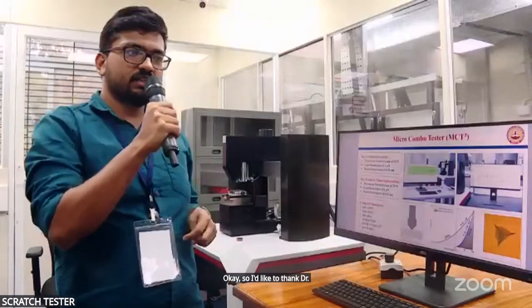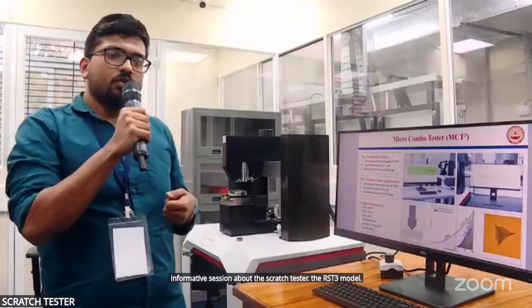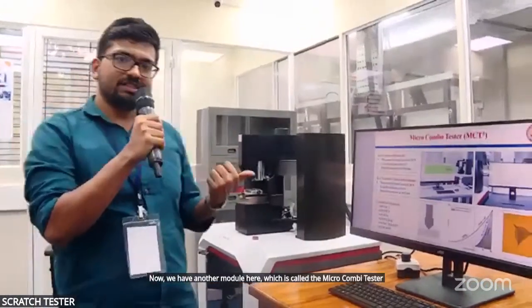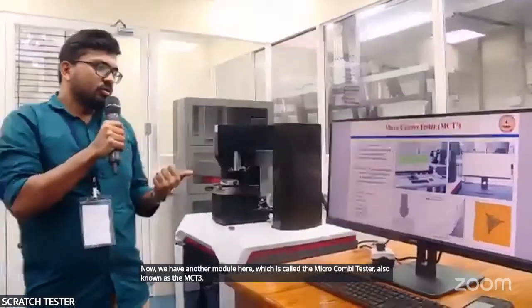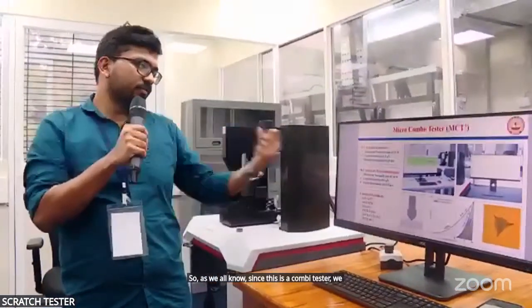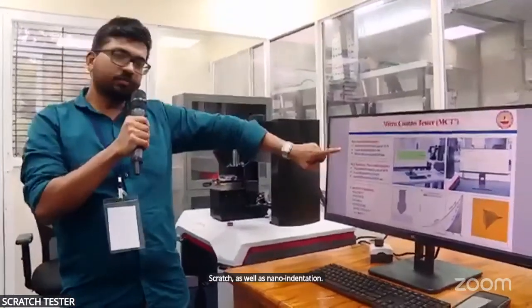So I'd like to thank Dr. Komal for giving us such an informative session about the scratch tester, the RST3 model. Now we have another module here, which is called the micro combi tester, also known as the MCT3. Since this is a combi tester, we have the facilities of both scratch as well as nano indentation.